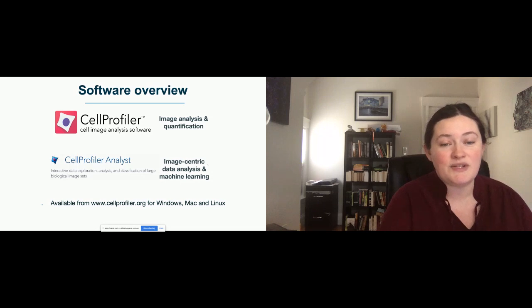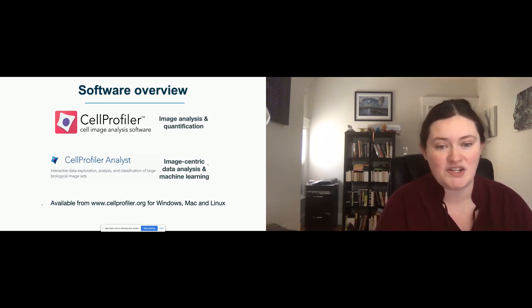Once you've done that, and once you've created a spreadsheet or a database with all of the measurements that you care about, CellProfiler Analyst is designed to allow you to actually use that to answer a question.